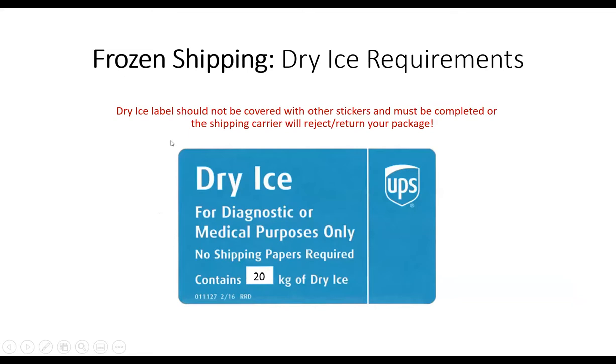Another important note is that there are labels for the dry ice on the packaging. You do need to record the weight of dry ice in kilograms on the packaging. If that is not filled in, then the courier can reject the package.